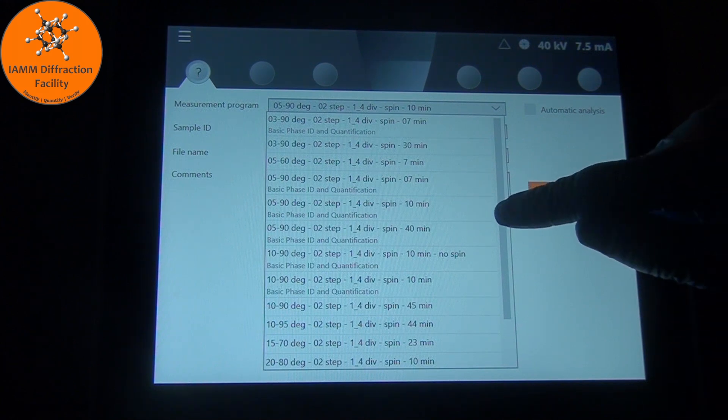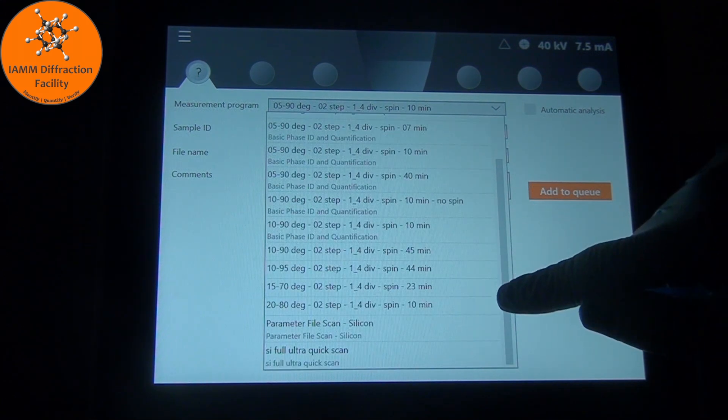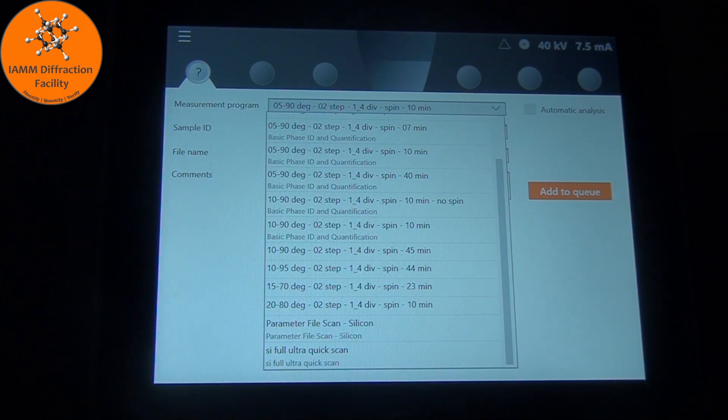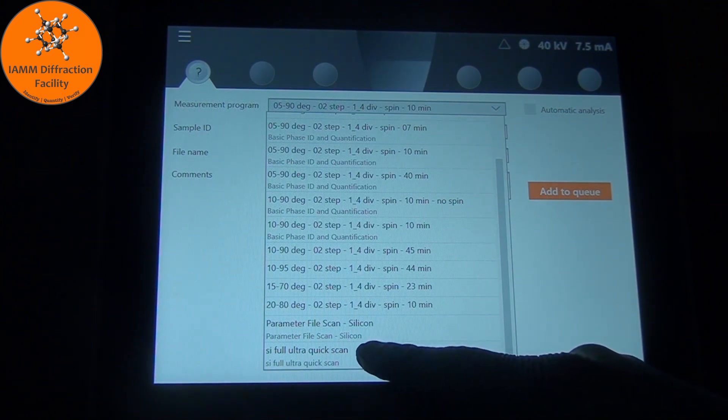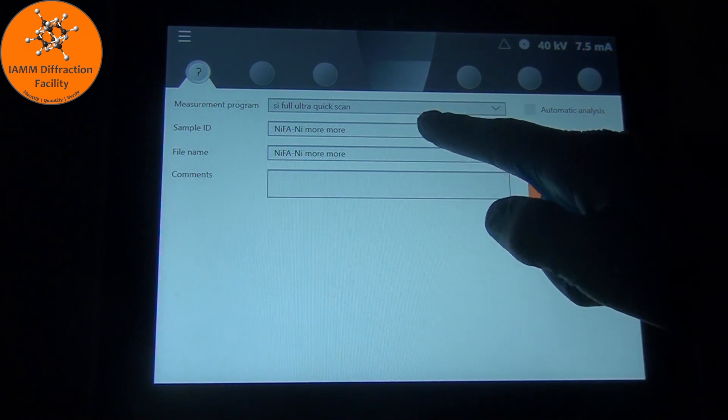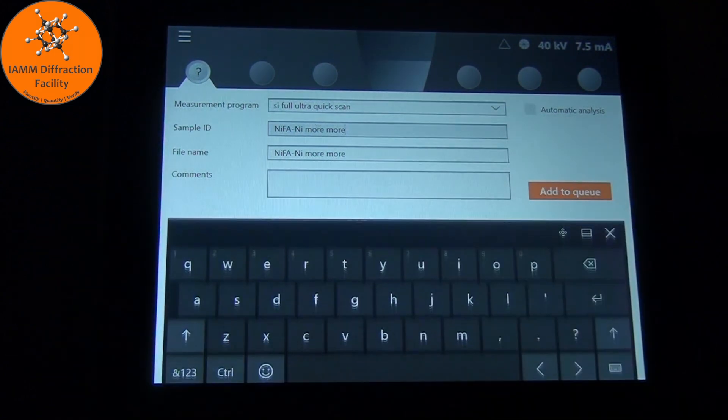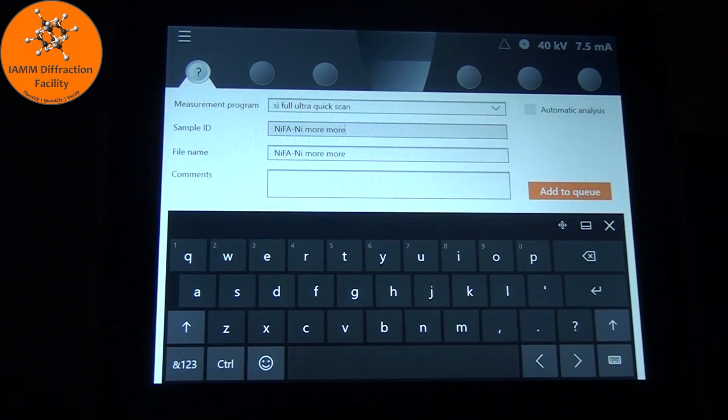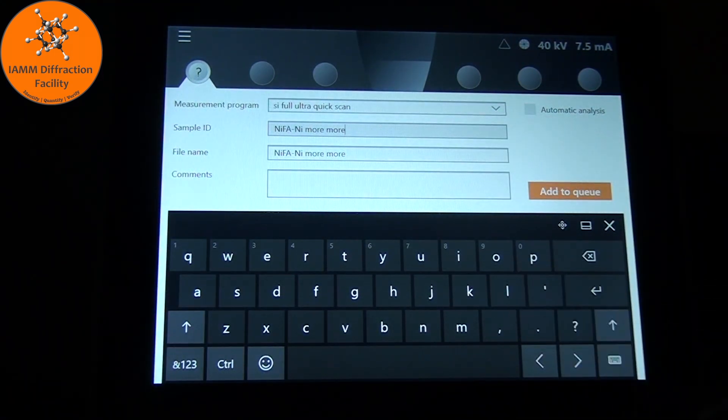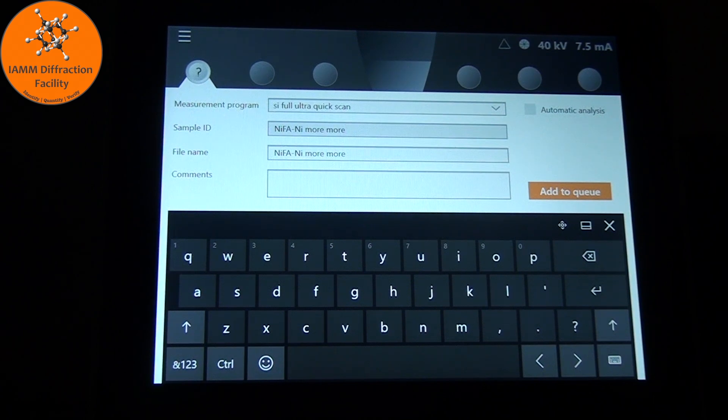For today, I'm going to use this silicon full ultra quick scan down here at the bottom, so I will click that. Now we just need to type in the sample ID. You can use the keyboard here, or there is a keyboard at the base of the Eris.